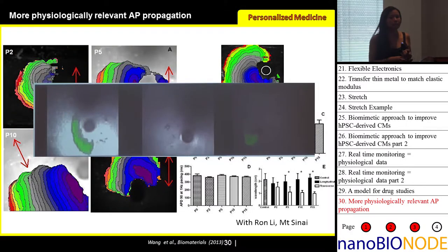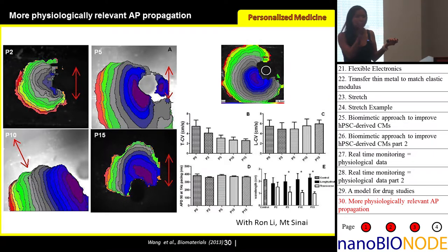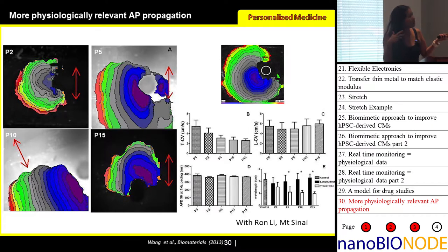We also compared this against different things that we were doing in terms of actually labeling the cells, doing action potential propagation measurements. And we realized that we were actually getting quite a bit of information by not fluorescently tagging the cells at all, by just doing optical flow measurements. These are the action potential measurements. So what we did in this first paper was we decided we were going to look at action potential, and with the optical flow, actually look to see how the duration of the beating changes over time.